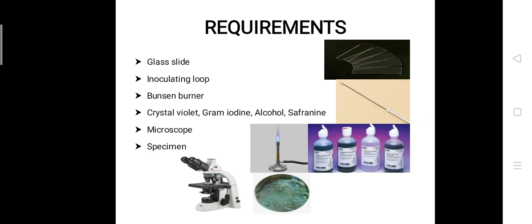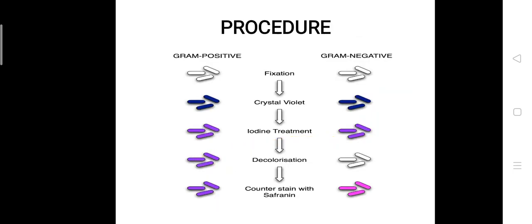And remember, before performing the staining, the smear should be very good. It should not be too thick, it should not be too thin. So let us see the procedure now.